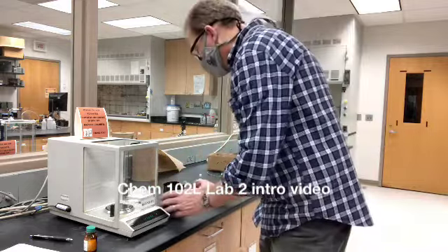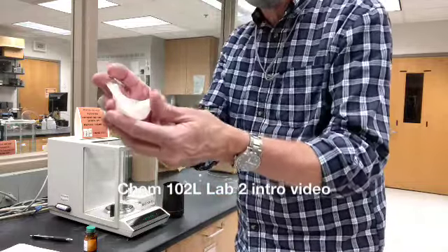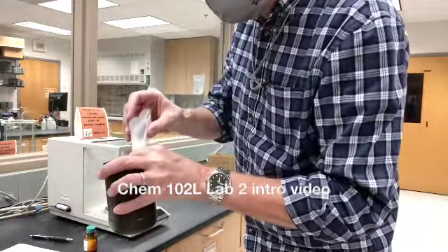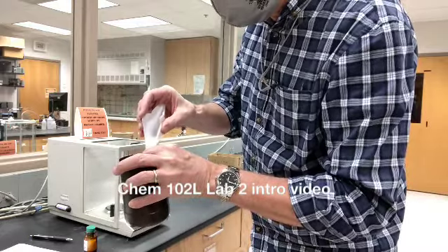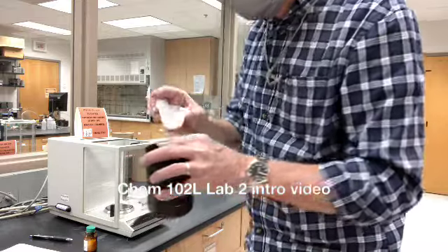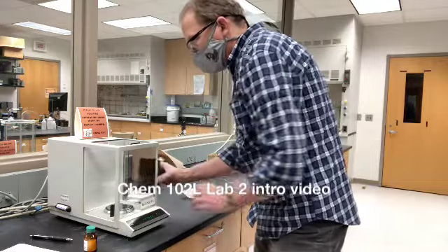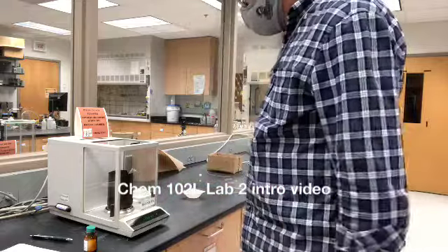So now, when I pour something in here and weigh it again, it'll tell me exactly how much I added. The weighing boat actually allows me to fold it into a kind of funnel, and I can pour it right into my tube. I want to be sure that I get it all transferred, even the bigger chunks. There's even a little bit of dust on here, but that's not critical, because what I want to know is how much I got in my test tube, and I read that right off the balance.